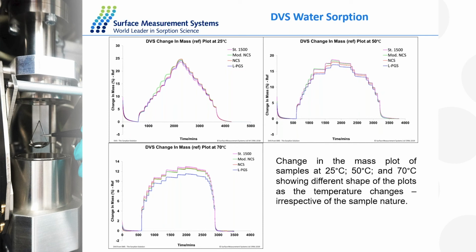Okay. I have here, thanks for that, Sabiyah, another question from Millie. I have a little difficulty understanding the mechanism behind the increased surface energy at high RH. Would the swelling take more cavity of the sample, leading to reduced surface energy?